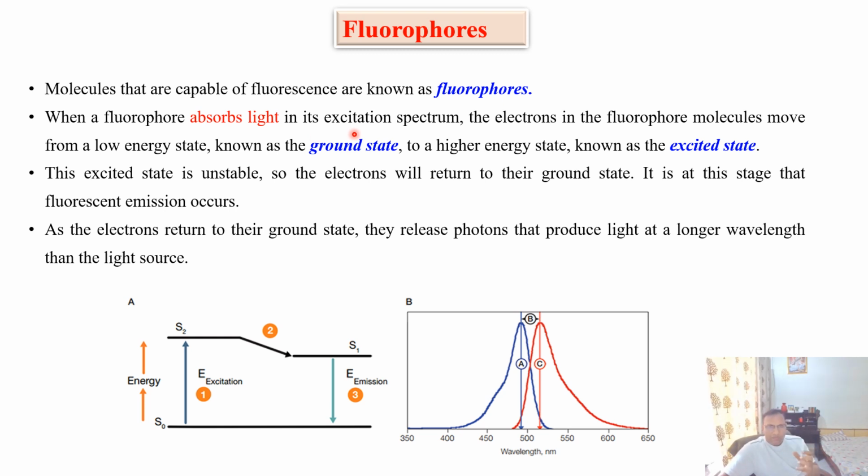Some certain wavelength of absorbed light can excite the electron of the cells or the object. Light has a certain wavelength and its own energy.